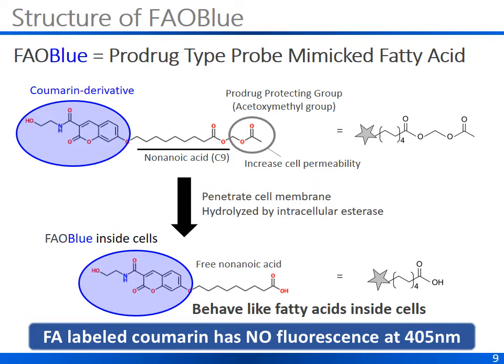Once inside the cells, FaoBlue behaves just like any fatty acid and is broken down by beta-oxidation. Please also remember, the fatty acid labeled with coumarin derivative is a blue fluorescent dye and will not fluoresce at 405 nanometer excitation.